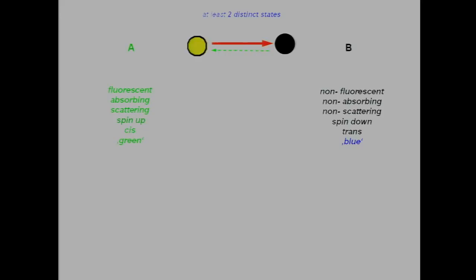So why was it fluorescent, in my view? Why was it fluorescent that this worked out first? Very simple. Not only because fluorescence is very sensitive and you get very good background suppression in fluorescence, it's very easy to disturb. You can easily disturb a molecule in its fluorescent state, because you can put light on it, you can relocate the atom, you can flip a spin. It's very easy to play on-off. This is why we broke the diffraction barrier first with a fluorescence concept. But it's not limited to fluorescence. It's very important to understand.